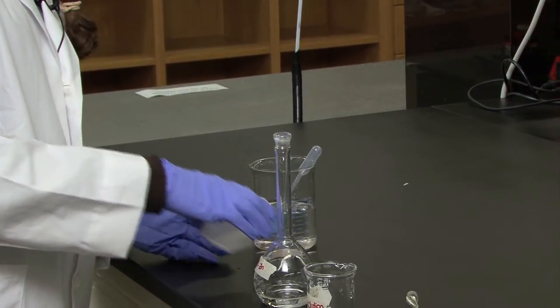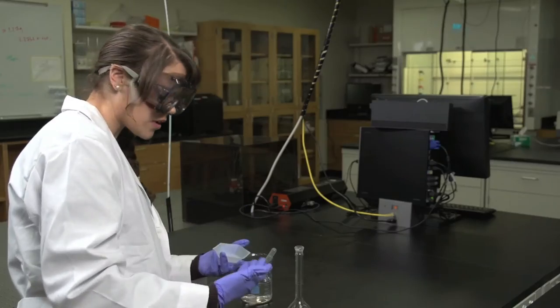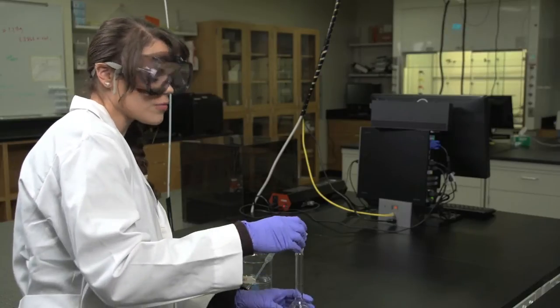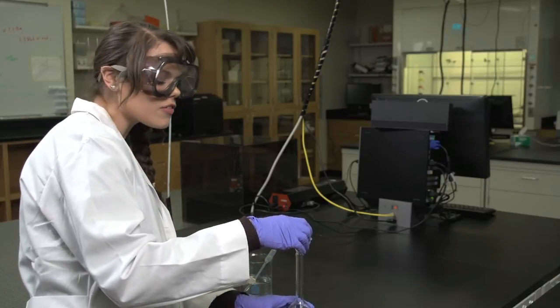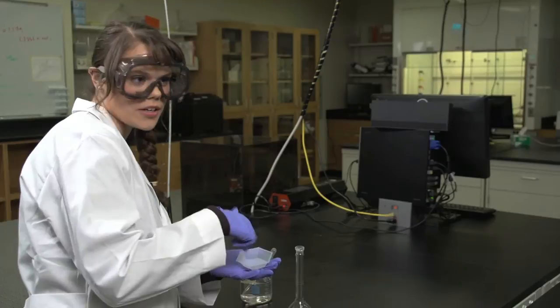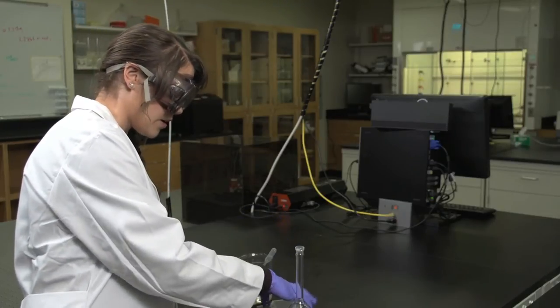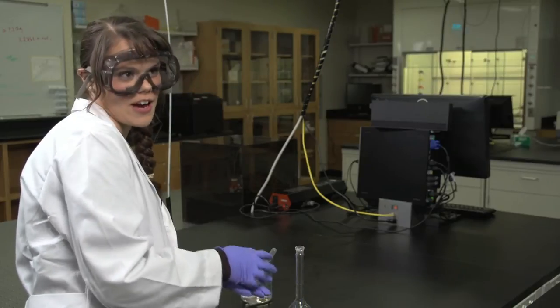If you are weighing something out into a weigh boat, you would do the same procedure. You would first put the solid directly into the volumetric flask, and then you would proceed to rinse the weigh boat into the volumetric flask. You would do this at least five times as well.